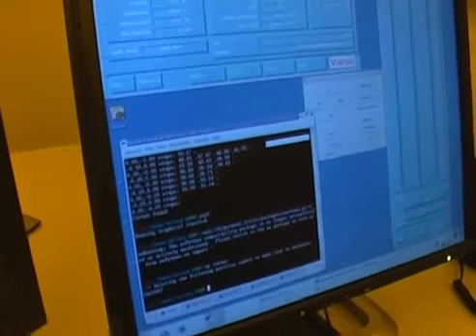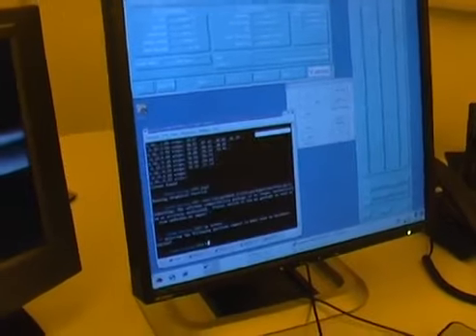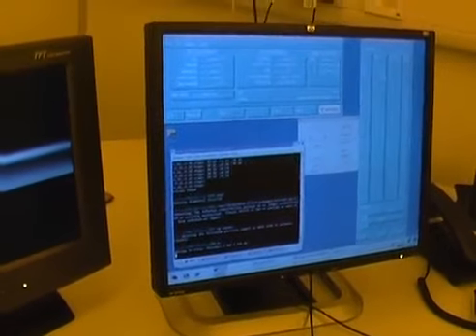So I've now blanked it. So I've now found the bottom left corner of the sample. And I'm going to save that position just in case anything goes wrong. The SP command will save the corner position. And then I can do the MC command, which is move cross.